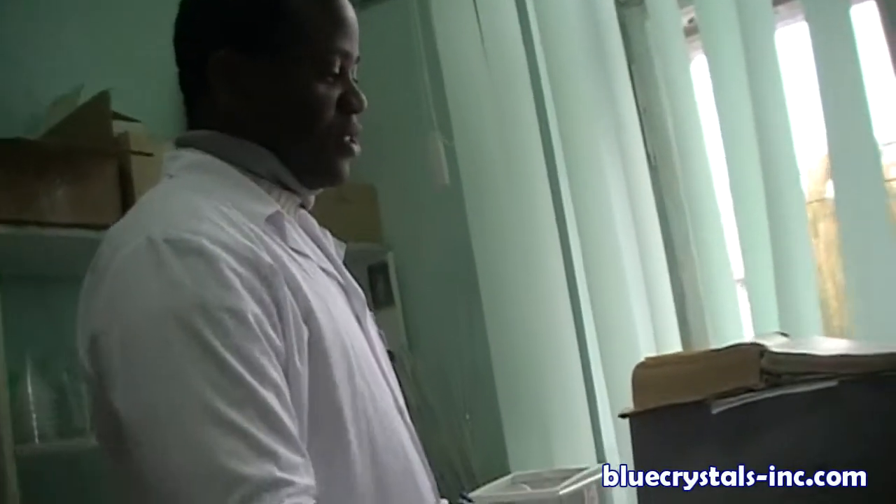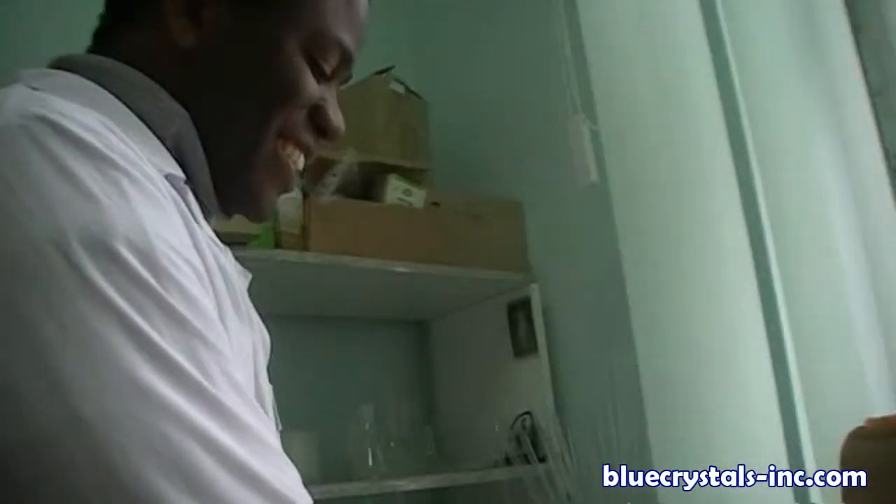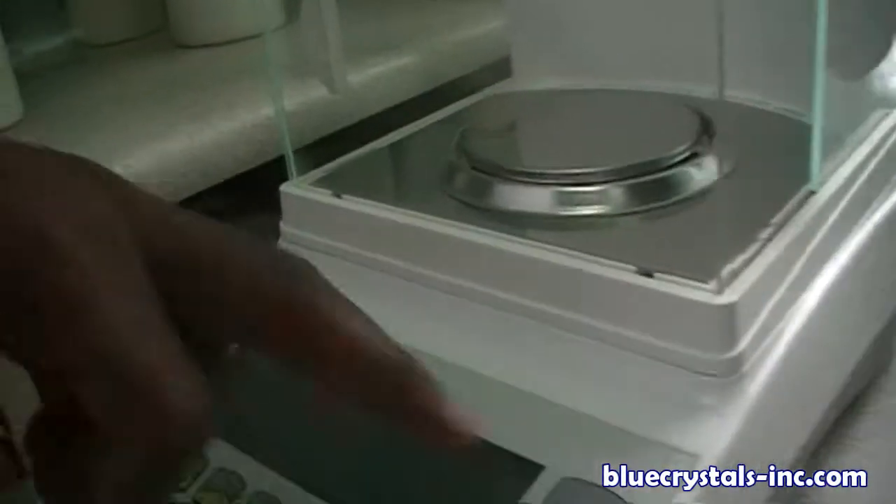And here is the analytical balance. You get four-digit numbers after the point for the precise mass. This is the old version, the Russian Abroca version. And this is the modern, the newest type — electronic.